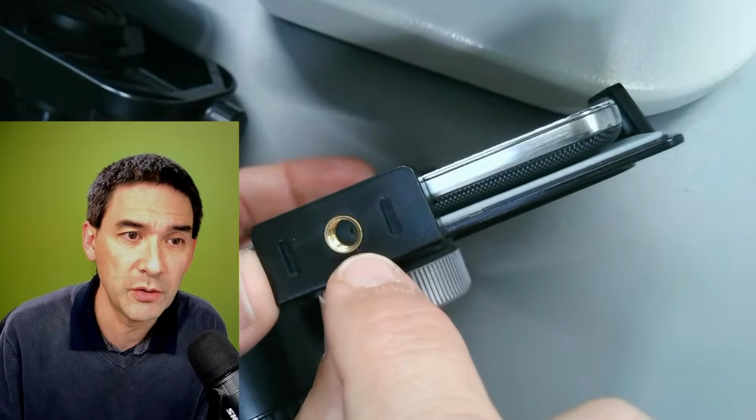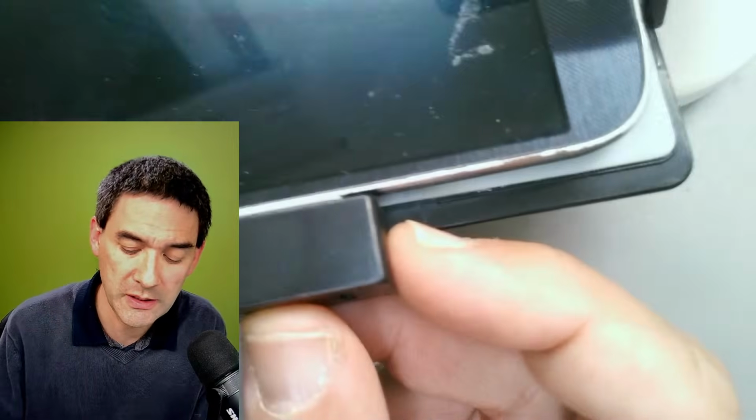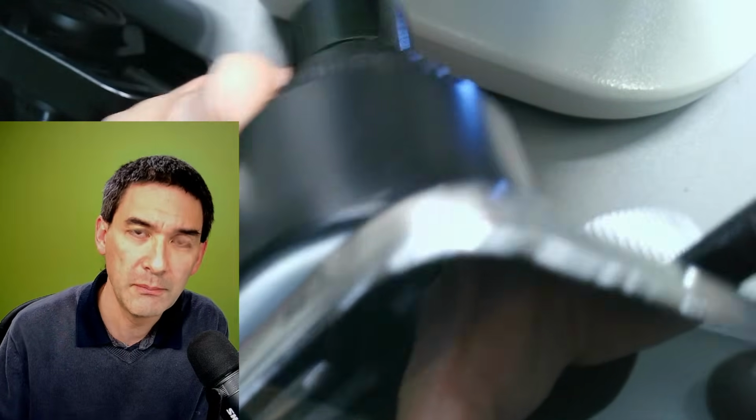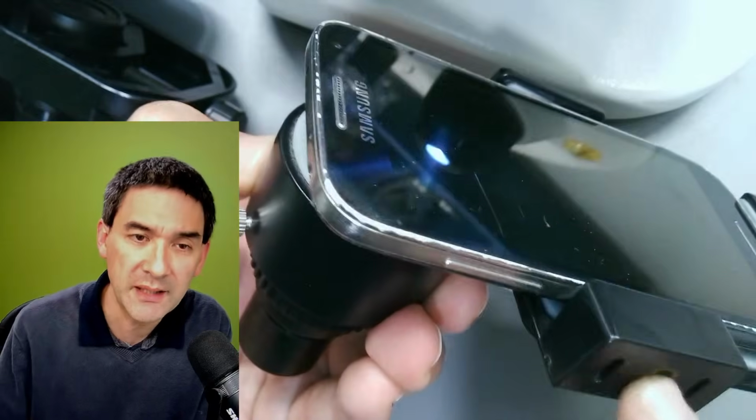So this is a little bit the thing that I just want to make you aware of. It's quite nice here, of course, also that you can connect a tripod here, especially if you need additional stability. For example, if you have a small microscope and it's too heavy and might tip over, then you can add additional support here.